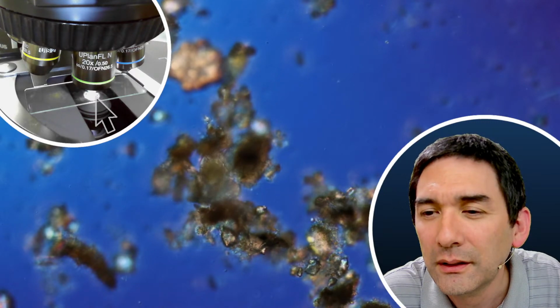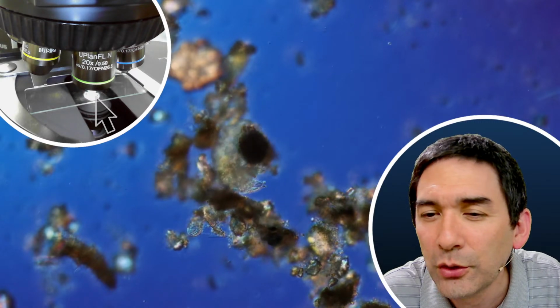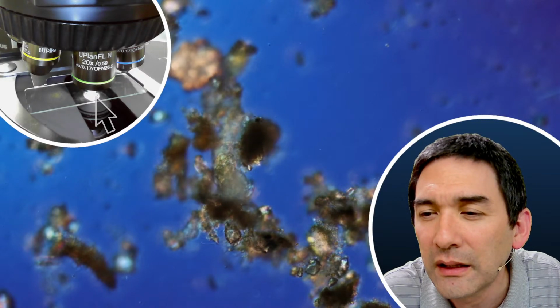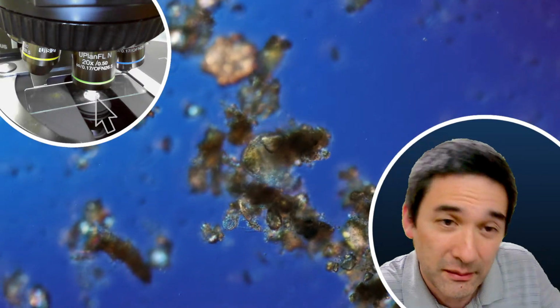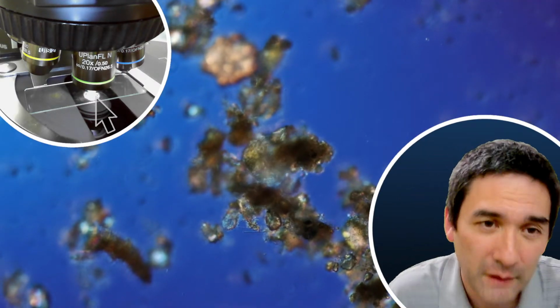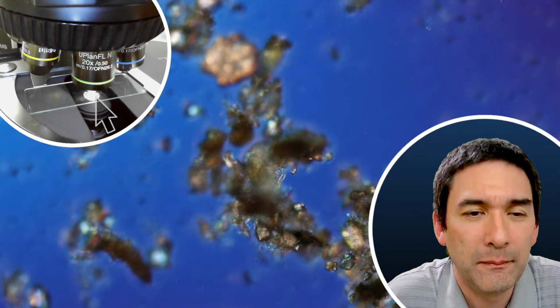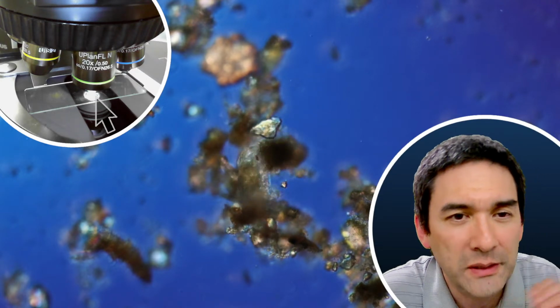So, have you run into the situation that you cannot completely remove dust on lenses that are in the light path of the microscope? This can happen. It is possible for dust or dirt to be in the light path.